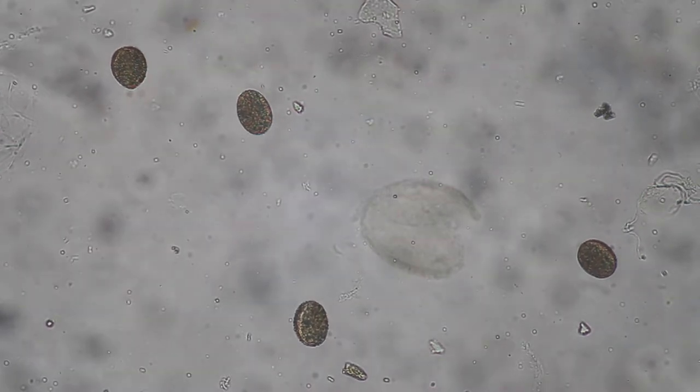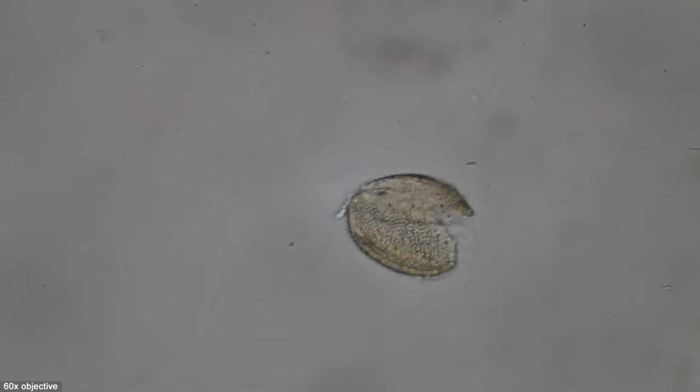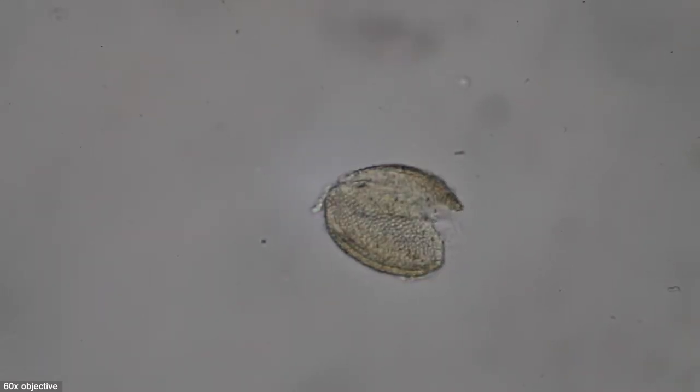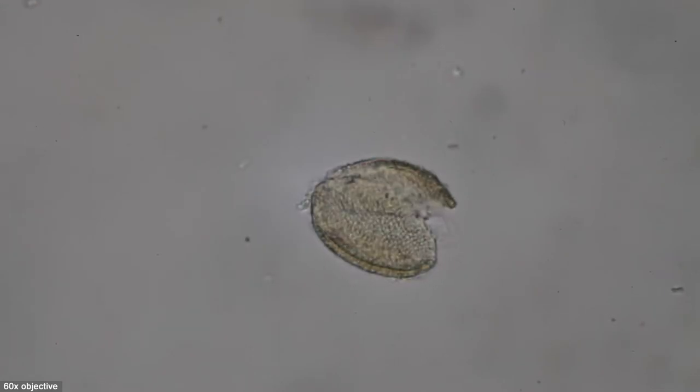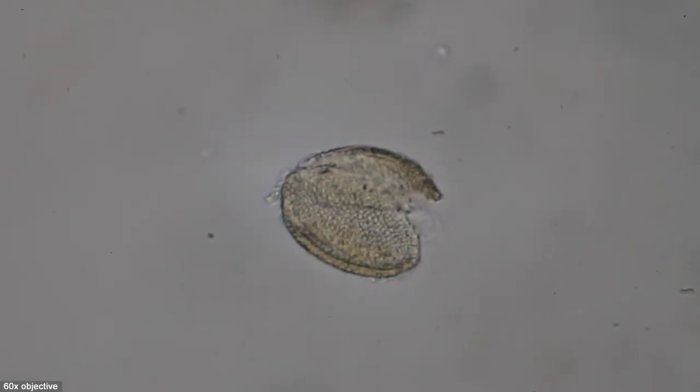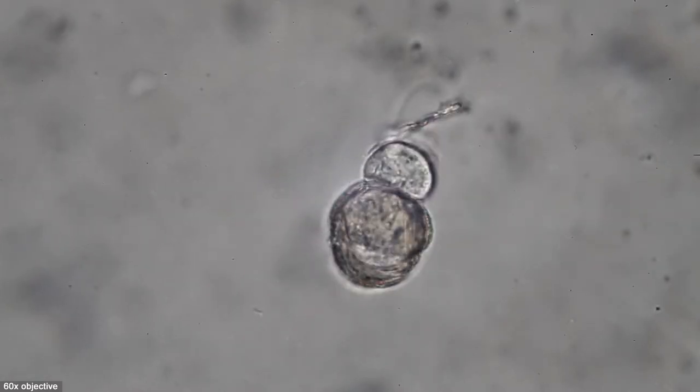And all of the subsequent videos here I did with the 60x objective. And you can see me focusing in and out. I added some digital zooms just to make it a little bit nicer to look at. But there were many different pollen shapes that I found.